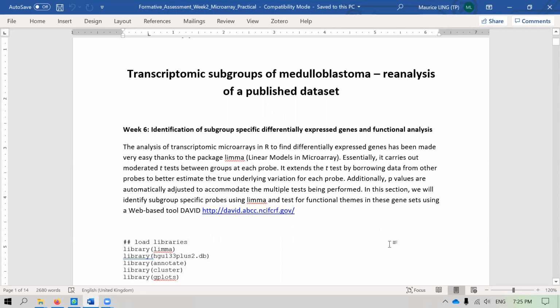So today we are continuing from our first practical session, in which we identified our microarray data into 4 different groups. You can treat it as group stage 1, stage 2, stage 3 and stage 4 cancer. What we are going to do now is find stage-specific genes. That means genes that are overexpressed only in stage 1, only in stage 2, stage 3, and stage 4. And what do they mean?